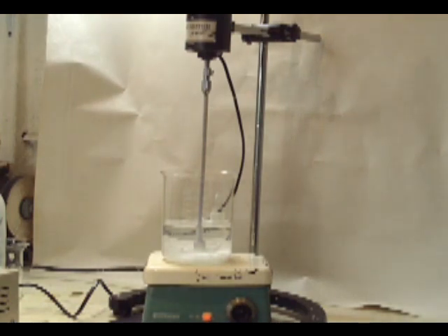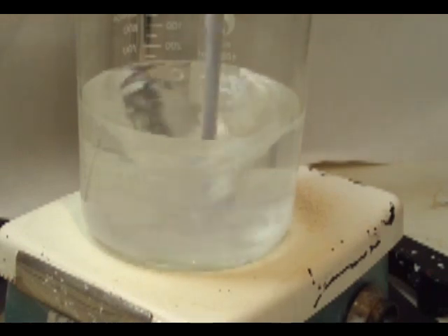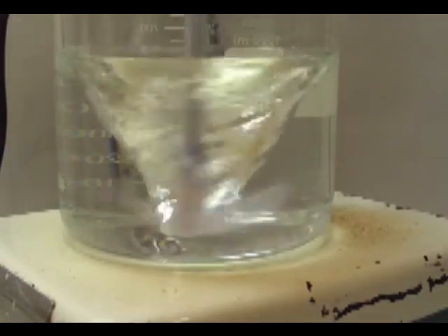I use a little bit of heat just to help speed things up and get it to dissolve a little bit faster. This took about 15-20 minutes to fully dissolve. We're about 10 minutes into it here, and now we're pretty much done. It's all dissolved, so shut down our mixer and move on to the next stage.